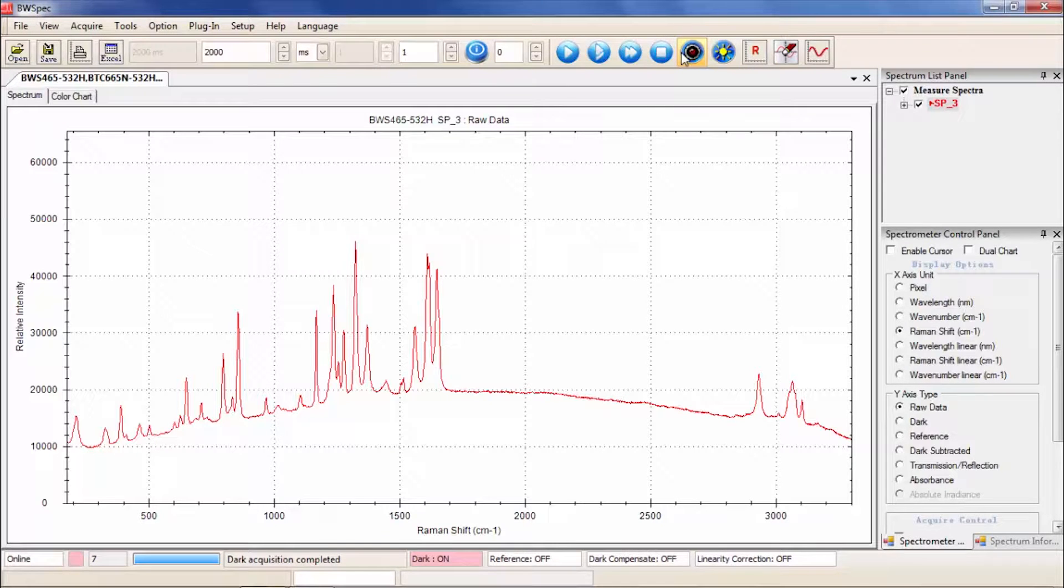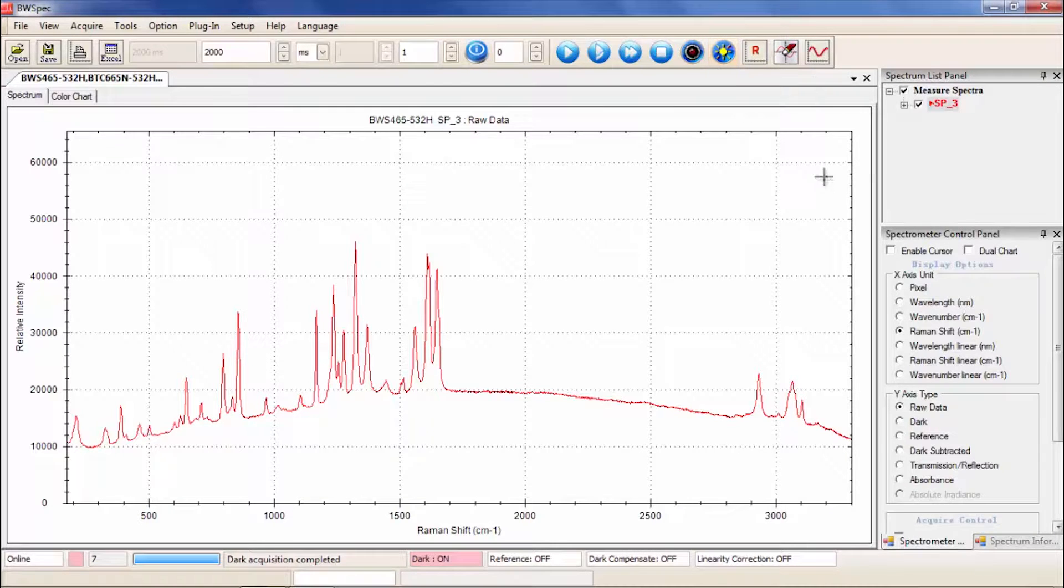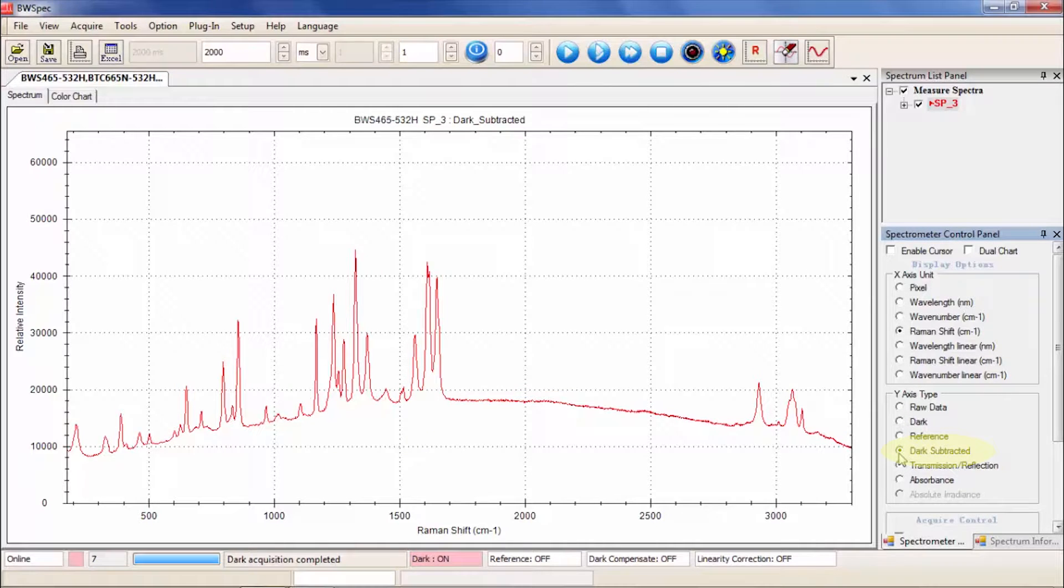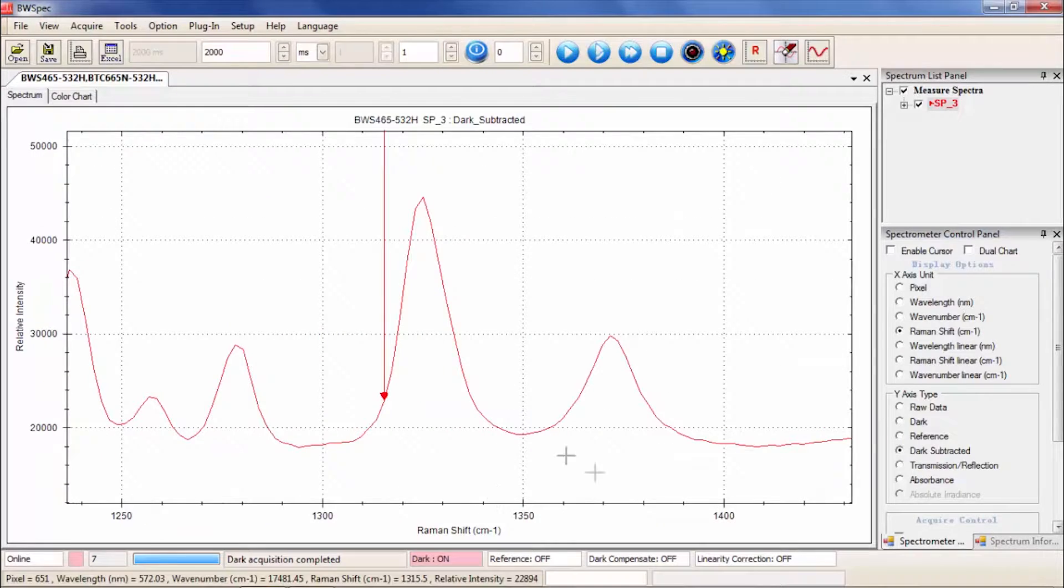In the Spectrometer Control Panel, under Y-axis type, click the radio button Dark Subtract. This is the first spectrum of Tylenol. You can see there are some very prominent peaks here.